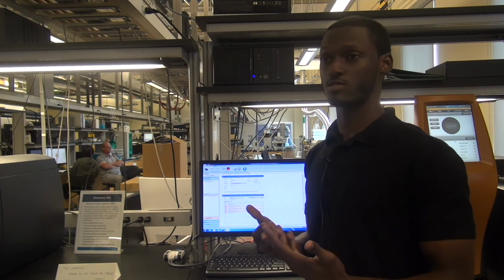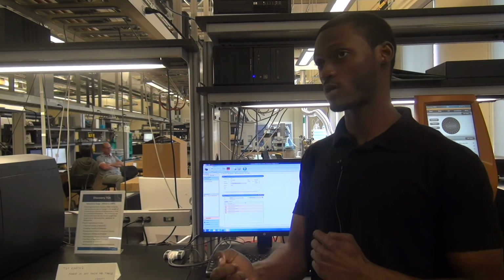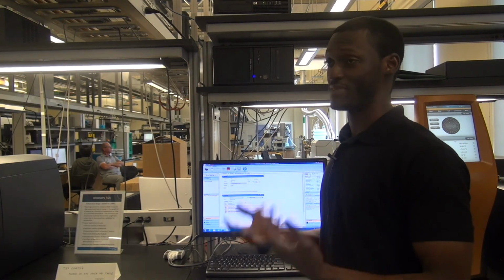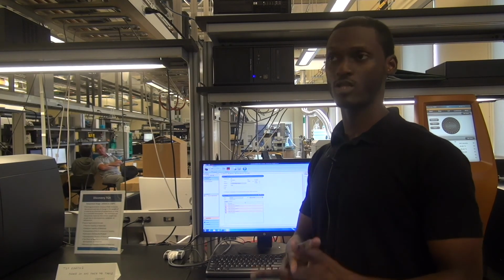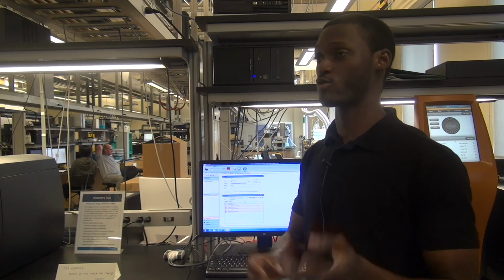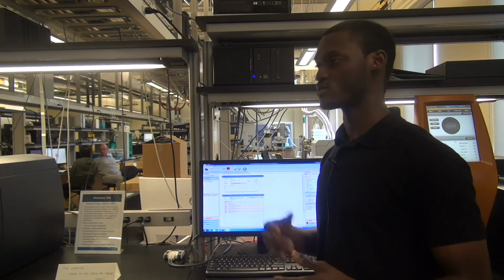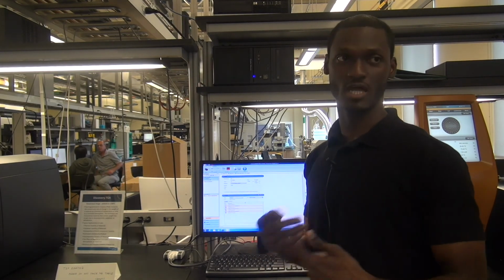Now, of course, sometimes you may want to do that for certain reasons. For example, I may want to cool my sample really, really quickly because I don't want it to crystallize. Okay, so that means I'm basically quenching my sample completely. That's possible, okay, with certain samples. So in that way, changing my cooling rate can change what I see in my subsequent heating, because now I've quenched it completely and there's no crystals in there. So it's going to look completely different than if I cooled it at 5C per minute and I actually allowed it to crystallize itself. Okay, so it'll be 2 completely different sets of data that you'll obtain by just changing that cooling rate.